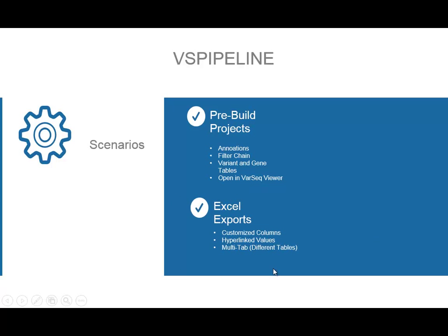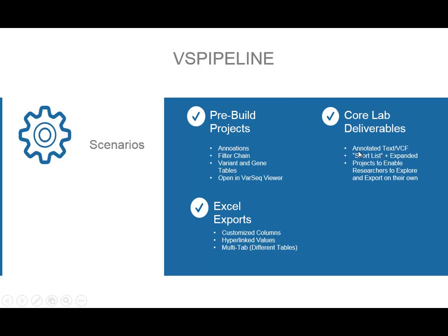Being able to get these beautiful, customized, and hyperlinked Excel spreadsheets is a powerful deliverable in which you may actually not use the project after that point — just simply pass that spreadsheet along, or in combination with the project. Core labs may also want to get annotated text files, VCF files, a combination of shortlist outputs as well as expanded outputs, being able to pass these projects on to researchers who might have their own licenses of VarSeq or might just be using it in viewer-only read-only mode to get to their own choices of what they want to export. So they can investigate any of these filters and run their own exports.